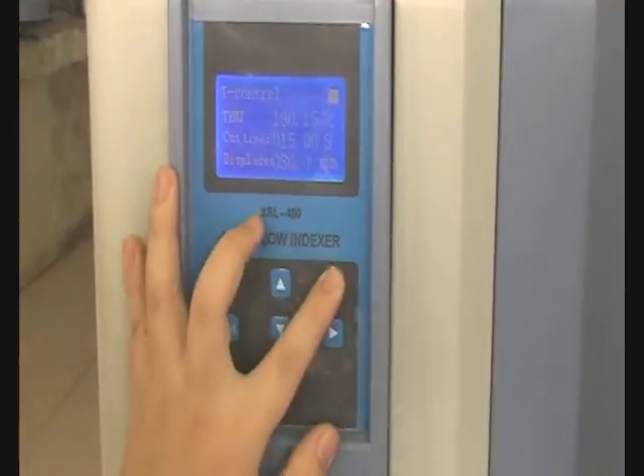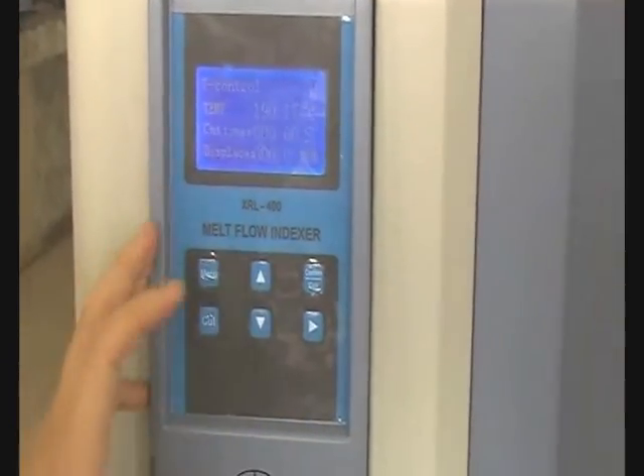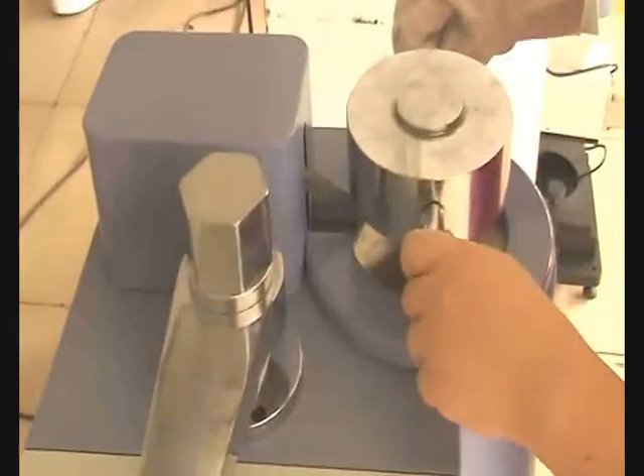Last, press exit to return to the finished interface. Press exit for a few seconds to start a new test.